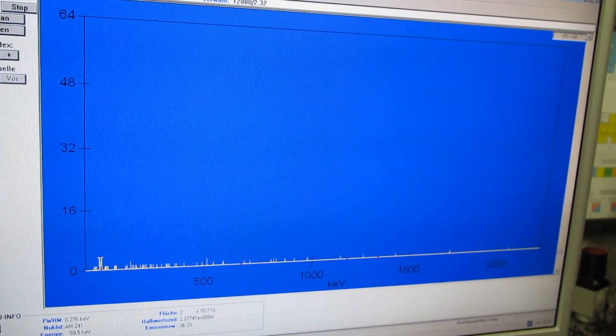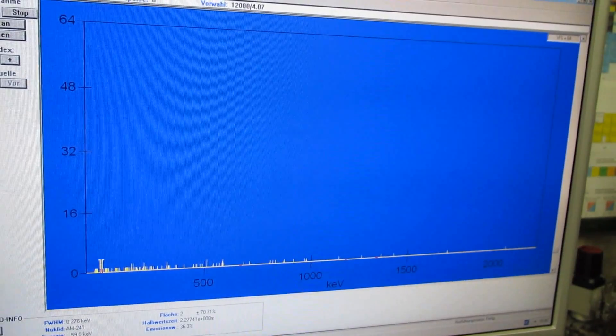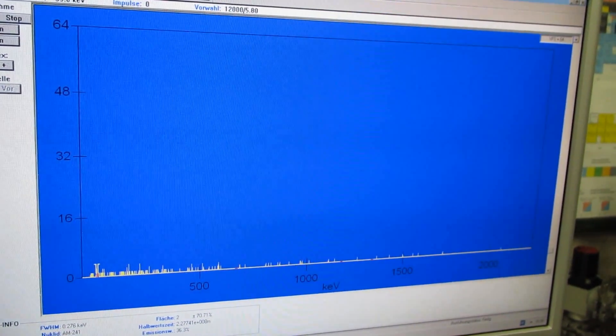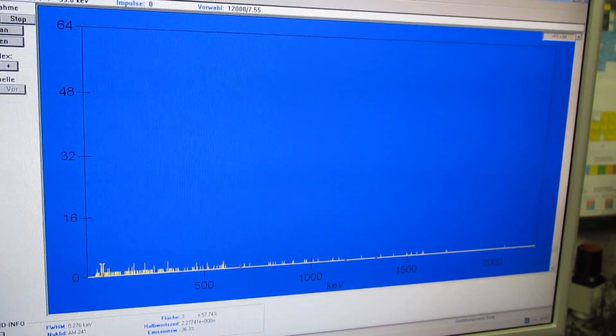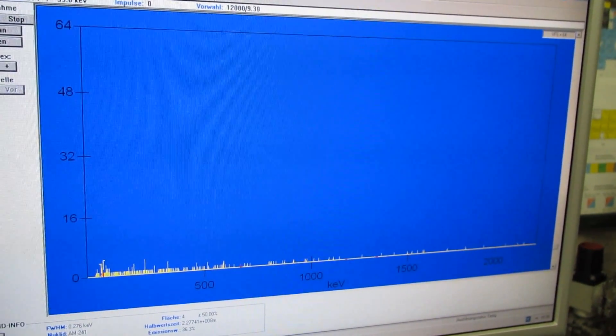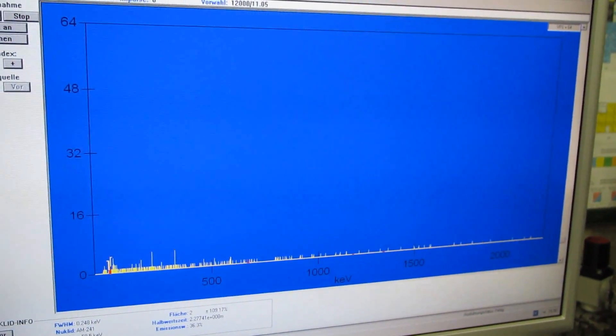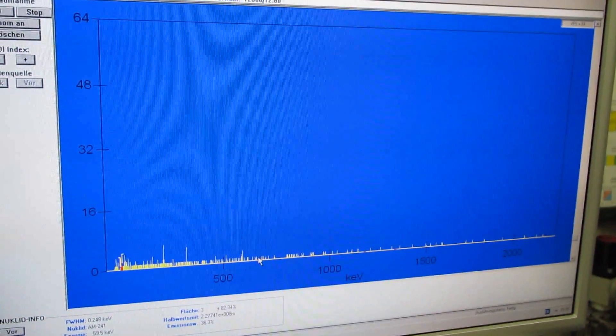And starting the measurement you can see, after just a short amount of time, how all these very characteristic peaks are coming up that are accountable for naturally radioactive substances.